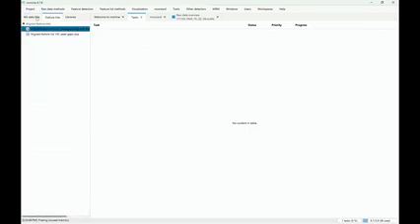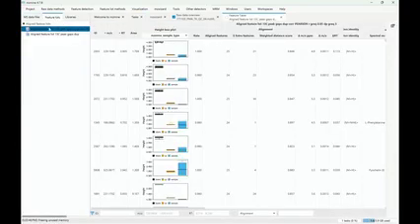And if we go over from MS data files to feature lists, we can just double click on any of the feature lists, and we're going to see that there's a lot of results, a lot of data being stored, and it only took something like 600 megabytes for the spectral library, the data, the feature list, everything in memory. And of course, this is a small data set, but now you can scale it up much more.